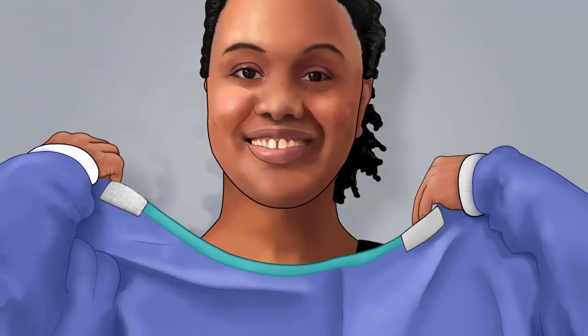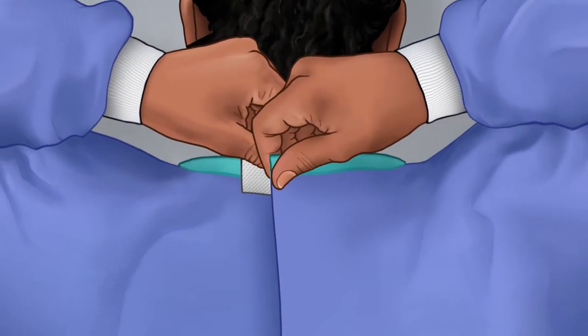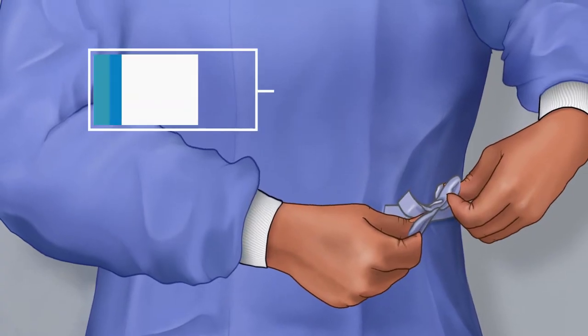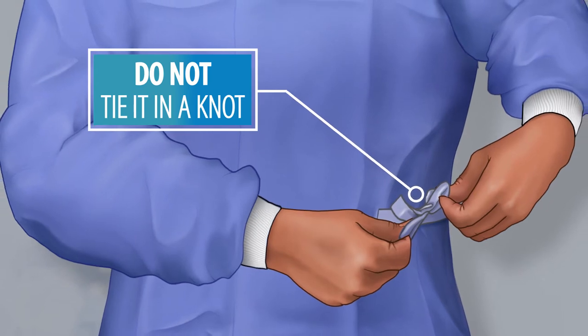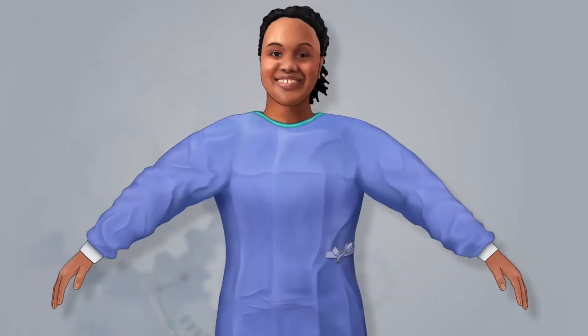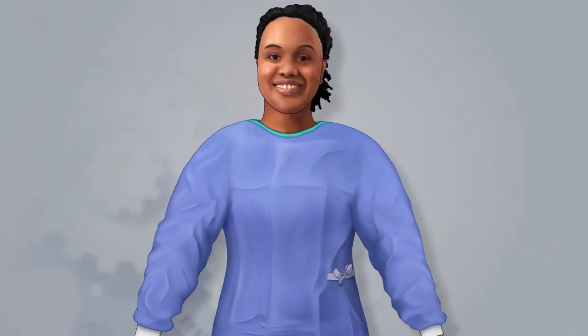Next, pull on the gown, fastening it securely behind your neck and back or side. Do not tie the knot or fasten it so tightly that you cannot easily remove it later. Make sure the gown fits well to allow for easy movement.